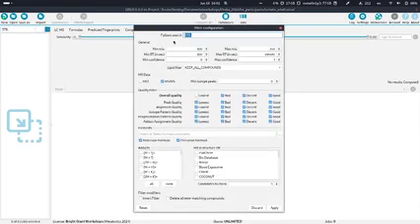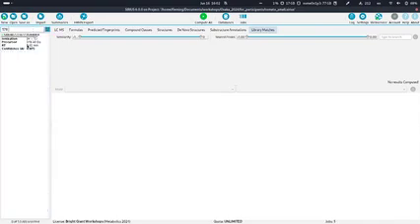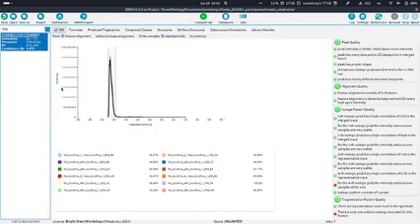Okay, this might also happen to you, that you don't have anything in your compound list. This is because we excluded something before. So let's click on the filter button again, click here on reset to reset the filter, and apply. And now nothing is filtered, and we will be able to just type it here. And now we'll see we have a compound, let's go back to just the SIRIUS view, which has the mass of 578.40 Dalton.